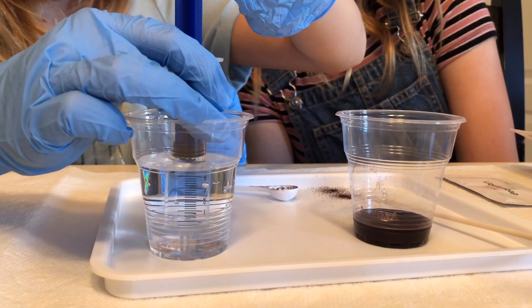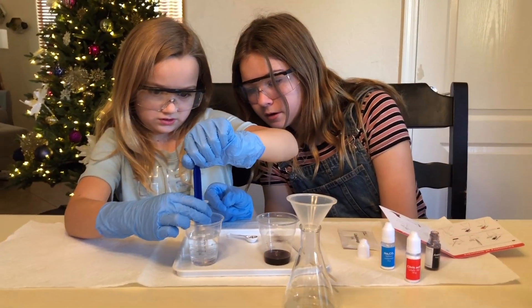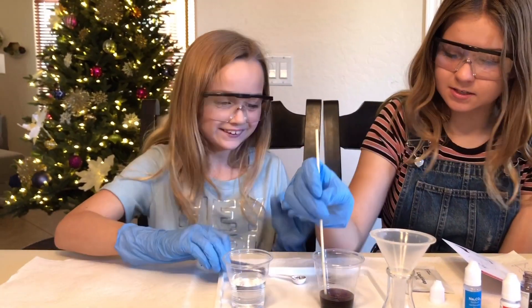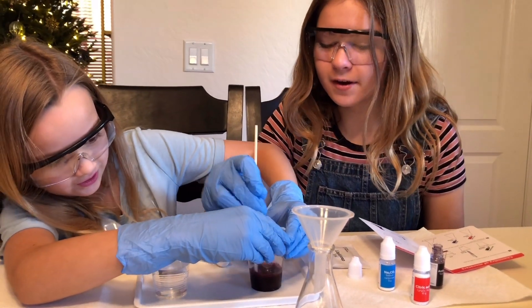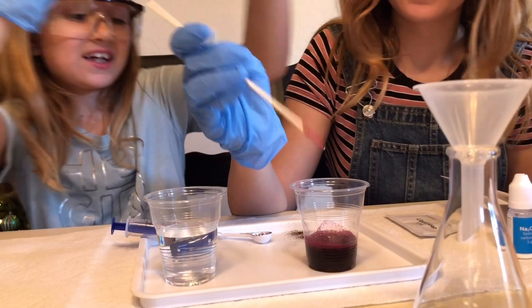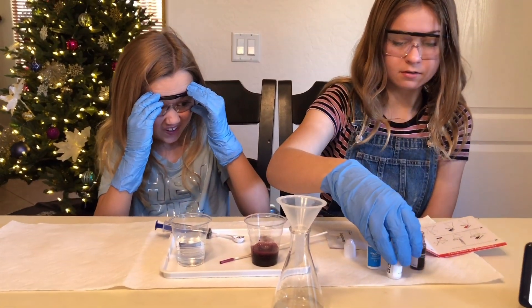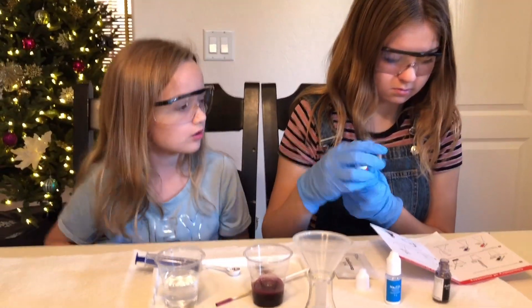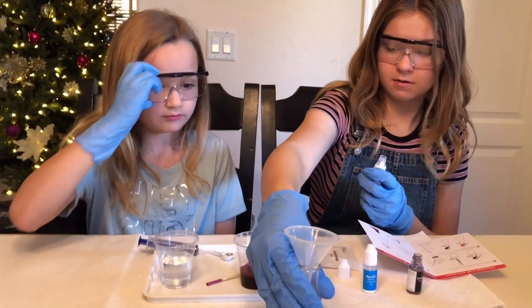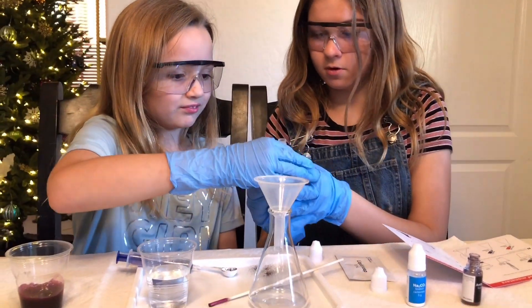Just up to the 10 line - put that in. Mix it - oh whoa! What color is that? It's like maroon or something. Now citric acid - one whole entire bottle of it. Pour it in there and let's leave this aside for now. Put the citric acid in.